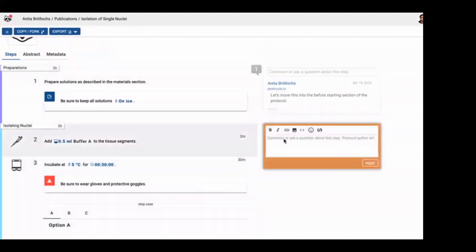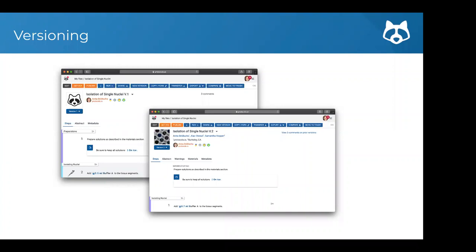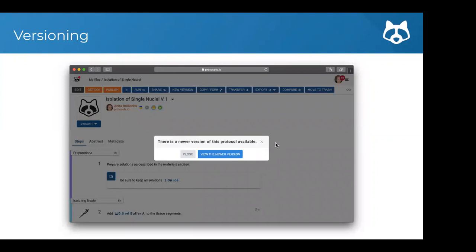If there are things you need to change, you can create a new version of the protocol. Version control is one of our core functionalities — at any time you can create new versions to capture all the changes you've made. For example, version one is in the back and then you optimize it and create version two. If somebody on your team still has a link to version one and clicks it, they'll get a notification that a new version is available. That way everybody always knows which is the latest version.